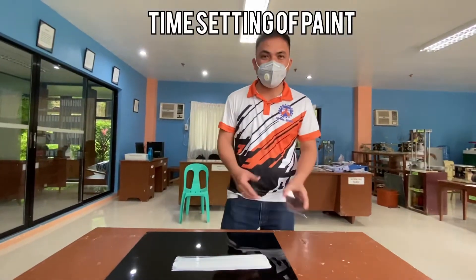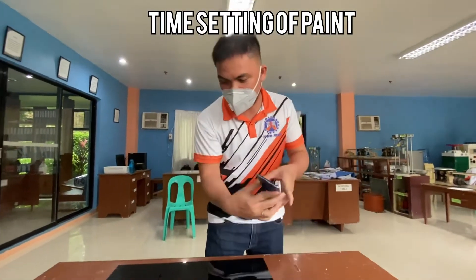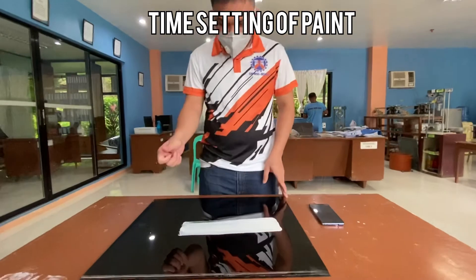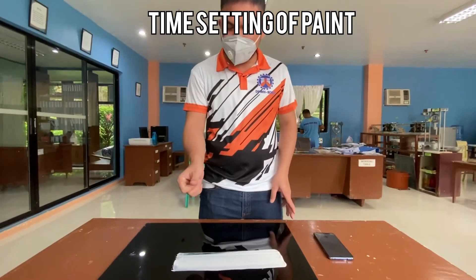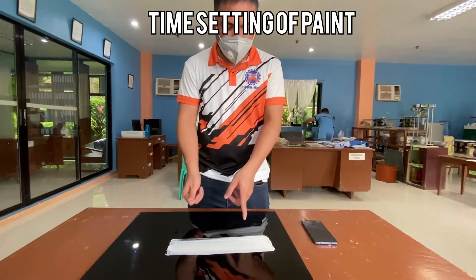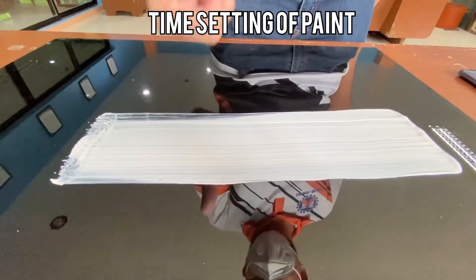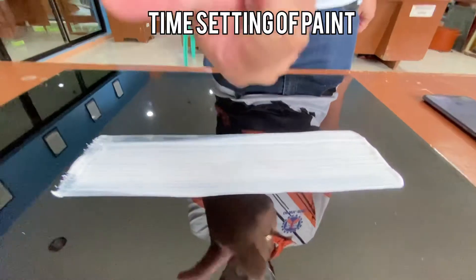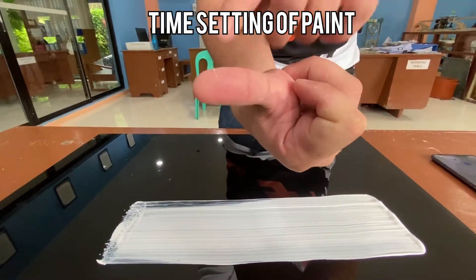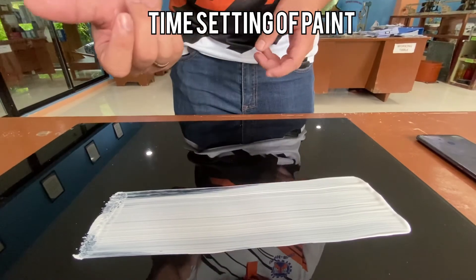Time check: 91 minutes have elapsed. So I'll check the film now to see if it is in set-to-touch condition. Gently touch the film, not less than one centimeter from the ends. As you can see, the paint is adhering to my finger, so it is not yet in set-to-touch condition. I'll check back after some time.